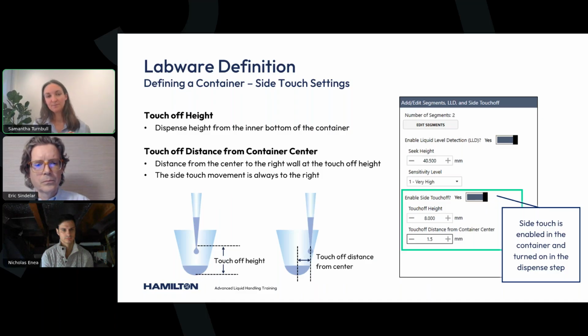Once you have all these options, they're not always the best case for every situation, but they are great tools in these specific cases. Once you have a good transfer, you're not seeing air bubbles, you're not seeing hanging droplets, everything visually looks consistent, you will want to move on to some verification and quantification of the transfer. So at this point, thank you for listening. I'll hand this off to Nick to go over some more details about some of that verification.